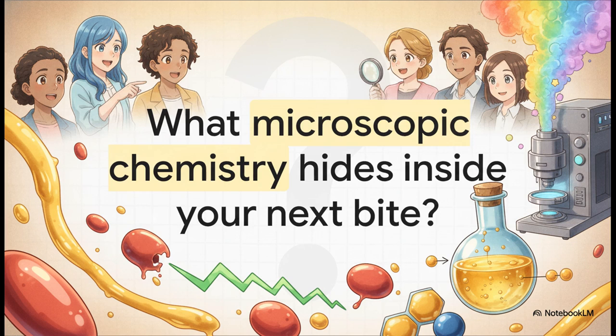From using acid to break molecular bonds, to relying on polar repulsion to isolate oils, all the way to vaporizing methyl esters in a gas chromatograph, it proves that our everyday meals are true biochemical marvels just waiting to be explored. So next time you consume a piece of cheese or fry a potato, ask yourself, what complex, microscopic chemistry is hiding inside that simple bite?